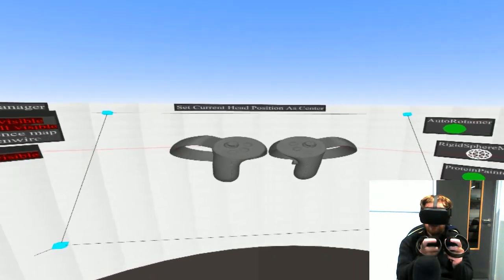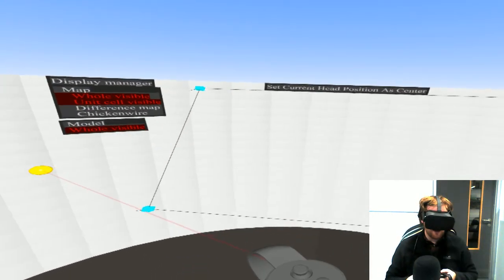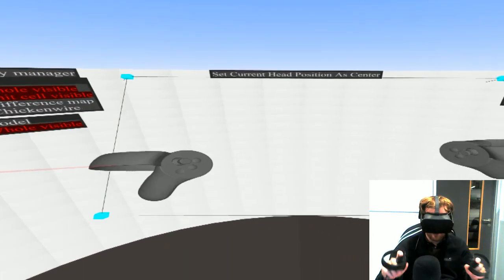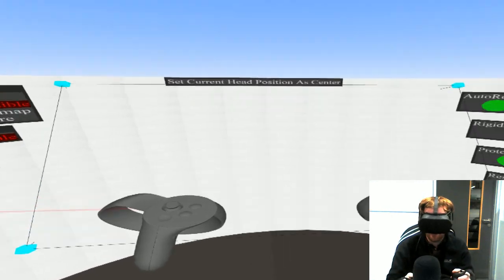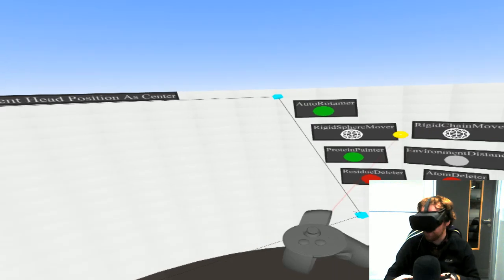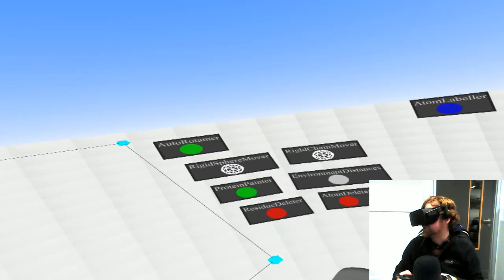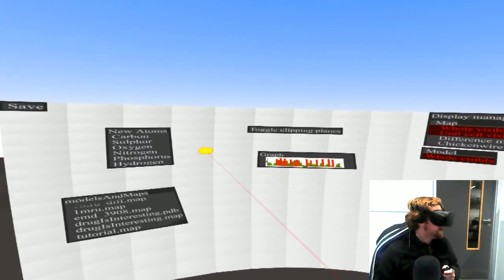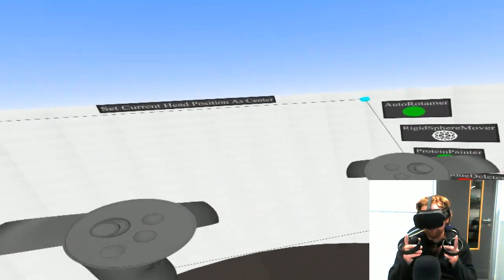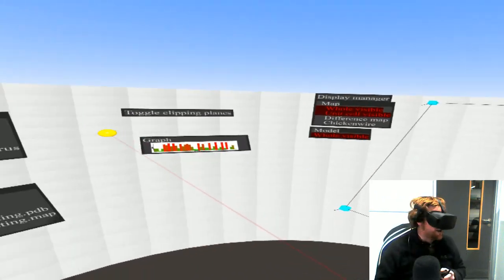You'll notice that the lasers are coming out of the sides of my controllers, which is what you want, because your work takes place here, and so you're always looking at something here, and these things on the side. These are your options. Extra hand movement there. And it's just as easy to point like this as it is like this.